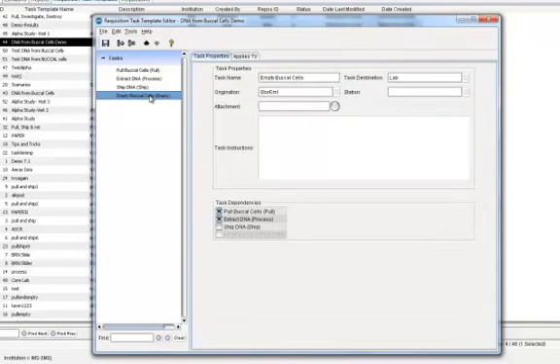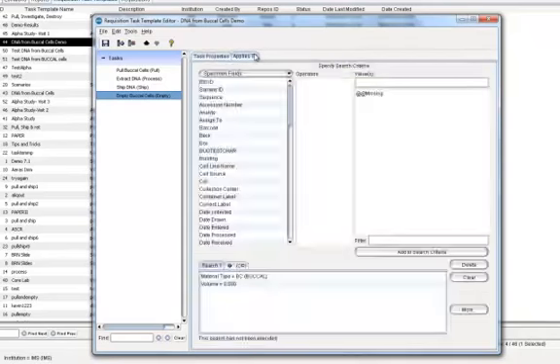The empty task will be dependent upon the pull and process tasks being completed. I have specified that this task be applied to buccal cell specimen where the volume, which is updated in the process task completion, is 0. To complete this template, I need to add a return to inventory task for the remaining buccal cells and the second DNA specimen.